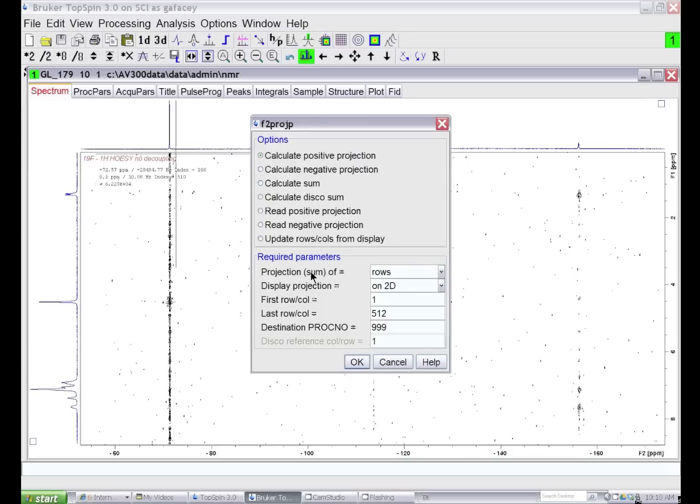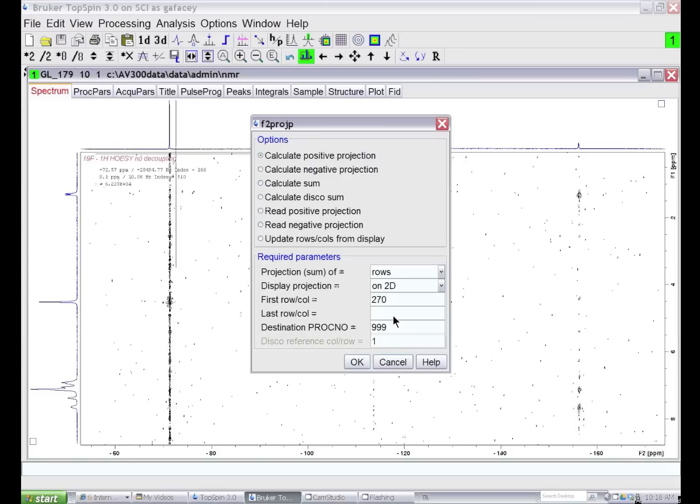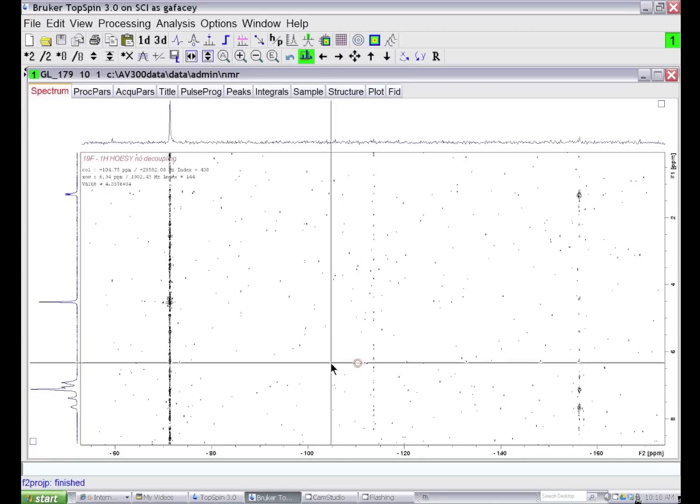We want to sum up the rows - we'll use rows 270 through 420, and store that projection in process number 999. If I click OK, I'll store the projection there.